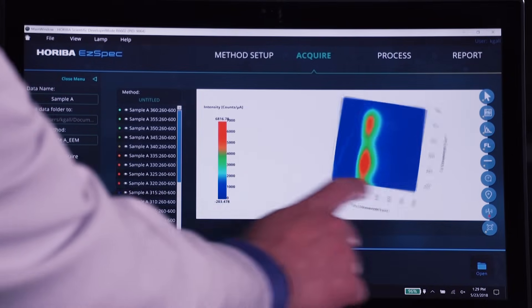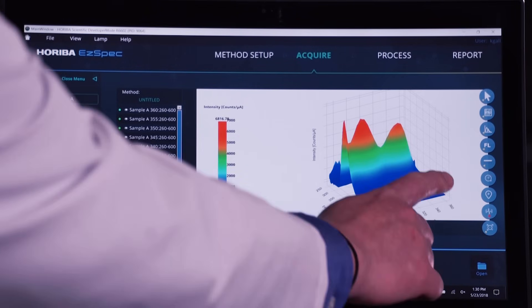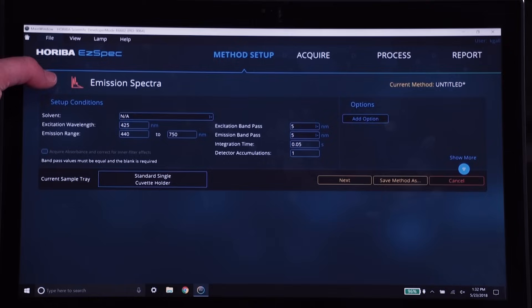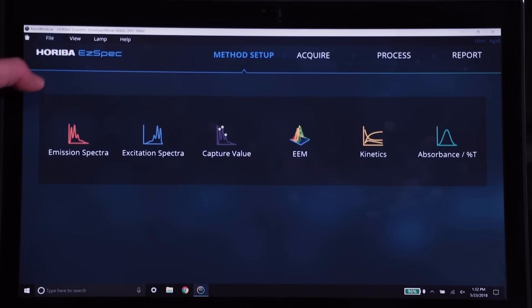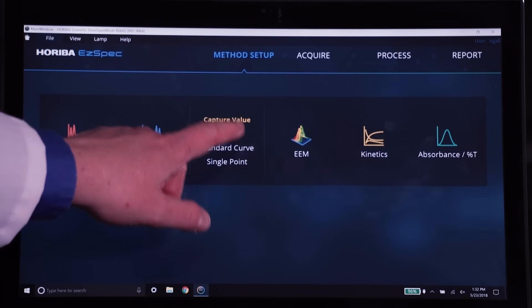EasySpec is designed from the inside out with the user in mind. An intuitive experience to the smallest detail.